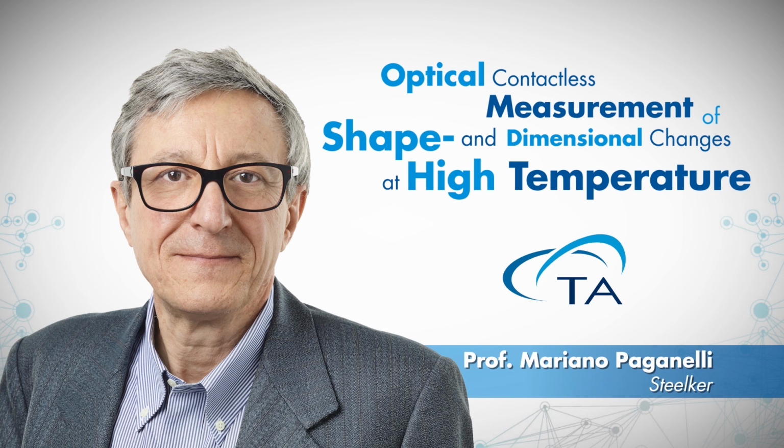Okay, thank you, Mariano. And I believe we have time for one last question that comes from Magali from Brazil: when is it better to use vertical versus horizontal dilatometry? Well, this is actually independent of whether you use a classical push rod or optical dilatometer, because the vertical dilatometer has been designed for the purpose of reducing the pressure on the specimen. So they are ideal for sintering tests. With a vertical dilatometer, you can reduce the pressure on the specimen virtually down to zero. With an optical dilatometer, you are 100% sure that there is no pressure on the specimen.